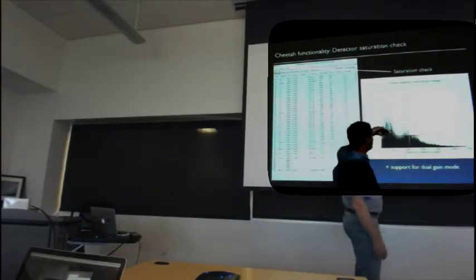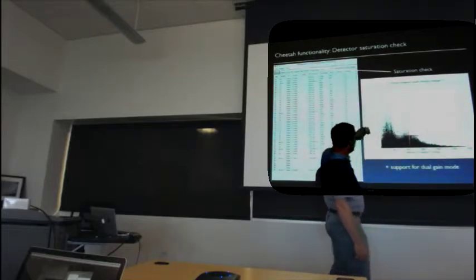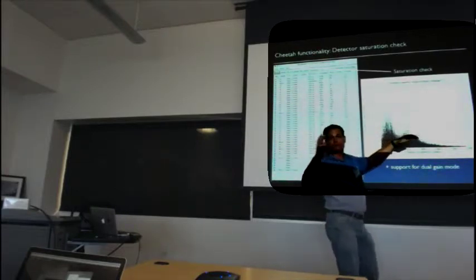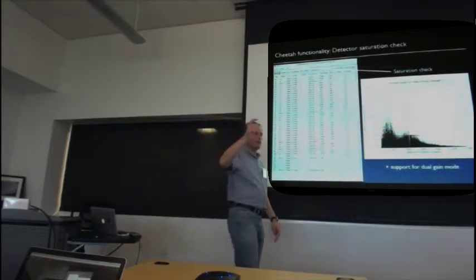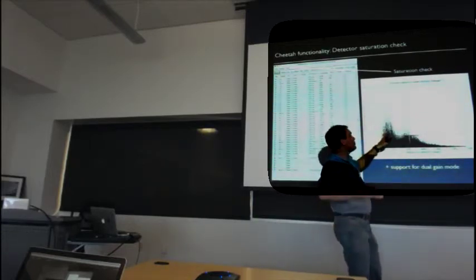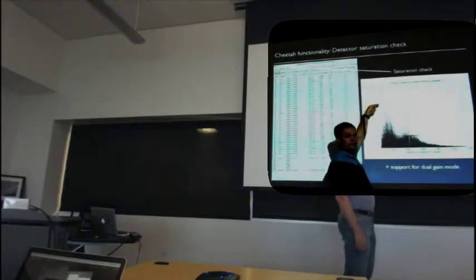And you can just plot up a saturation plot here. So usually it saturates at about 16,000 counts; this axis goes to 20,000. In this case, we're running dual gain mode, because the CS pad can run in a mode where you can, per pixel, run in high gain mode or low gain mode. And what we've done is, on this side, run in low gain mode, which means you effectively get more dynamic range, up to about 60,000 counts. You can still saturate that, of course.